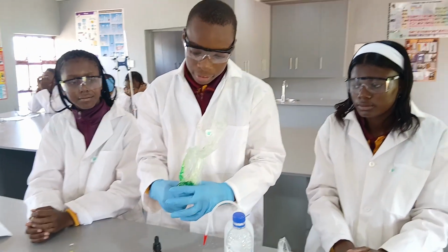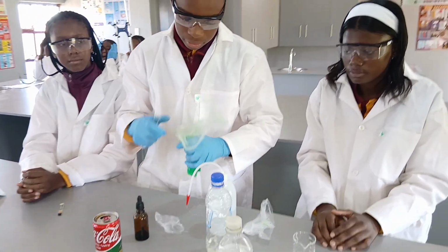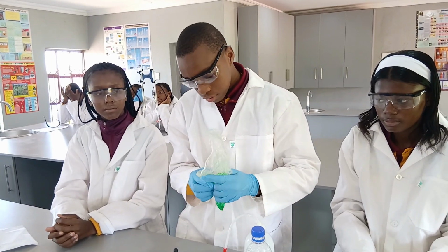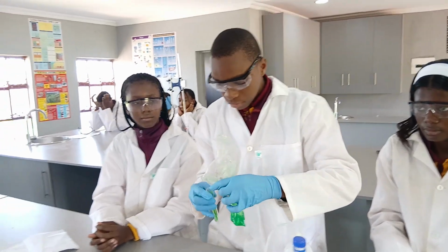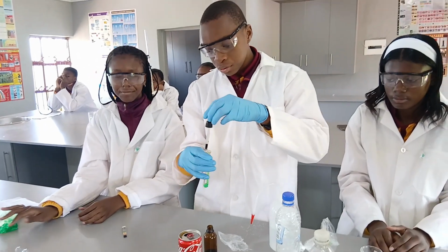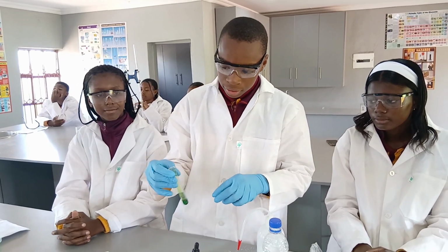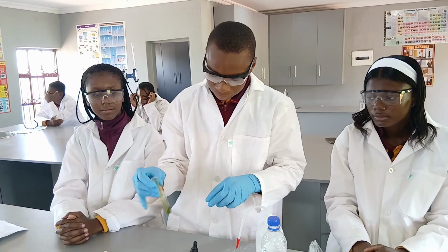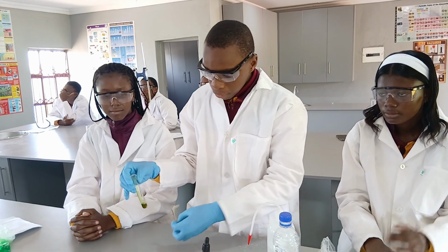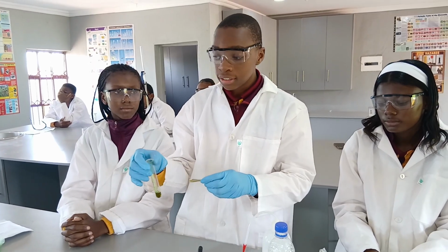So we want to check if sunlight is an acid or a base. So we'll pour a bit of it into this. We'll grab our universal indicator and pour 2 drops in here. After we do that, we'll shake it so it can mix. We'll grab our pH scale and check the color. The color is yellow, meaning that it has a value of 5, meaning that this is an acid.